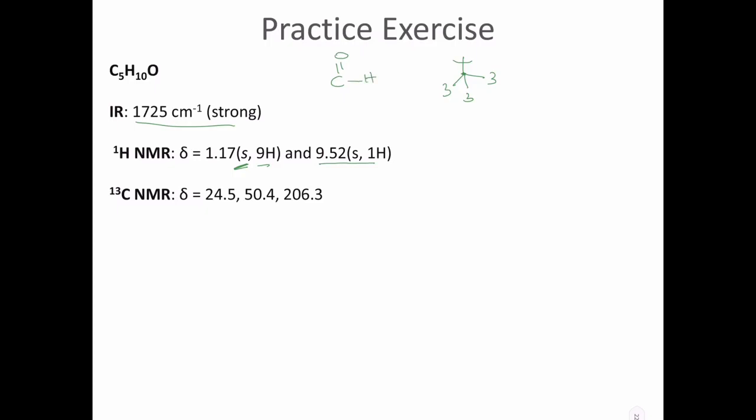Any other information we know? Let us see. So an aldehyde is accompanied by a carbon NMR signal that appears at around 206. Remember we said carbonyls, like an aldehyde, a ketone, or it could be an amide or carboxylic acid, will appear at around 180 to 220.